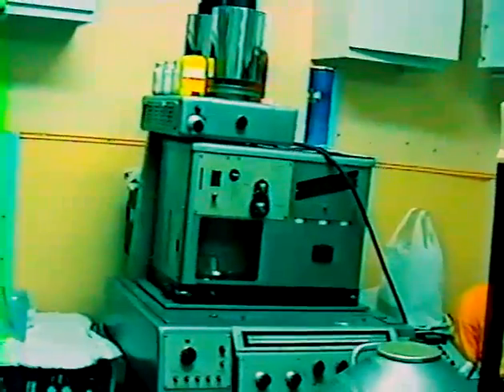And we have been investigating also the effect of different additives, ions, oxides, etc. on this thermal decomposition of different halogenates. That was the former topic of Professor Schornich. So that's all I could show you in our lab.